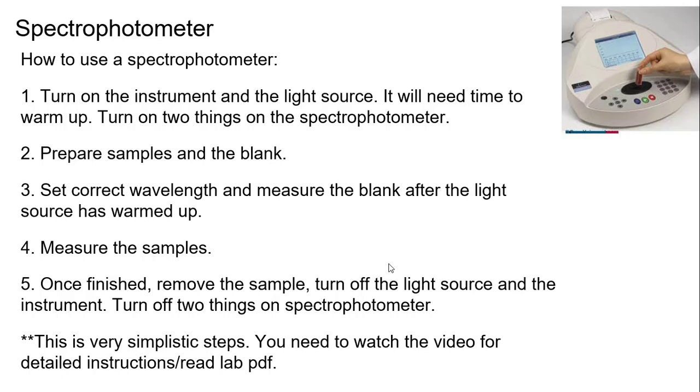How would you know what the correct wavelength is? You can turn the knob, and you take the value that's the highest. That would be your correct wavelength. You would be able to visually see the numbers change when you do this. Most of the time you'll just get 0. And then eventually you'll start seeing the number go up, up, up, and then you'll finally hit a peak, and then it'll go back down.